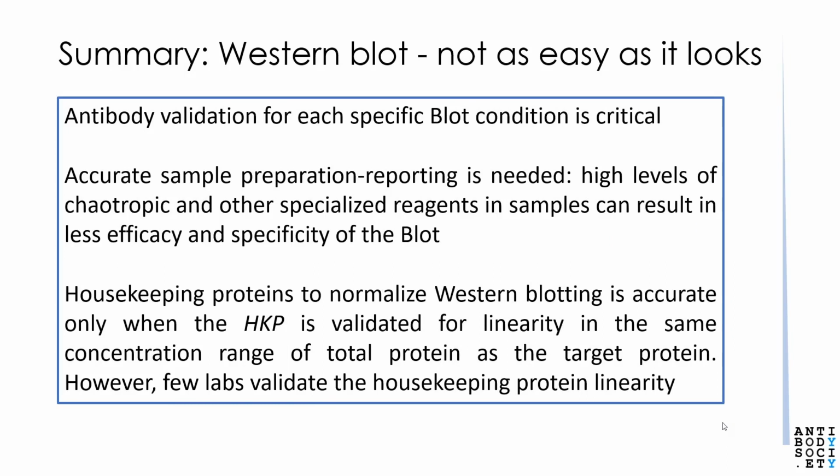So validation is critical. On top of that, sample preparation is also very important. We need to not just prepare samples in a certain way, but we need to report how we prepared those samples. We have found that using certain things like urea can affect our downstream applications. So once you report that, other people can then reproduce the results you got using the same conditions.